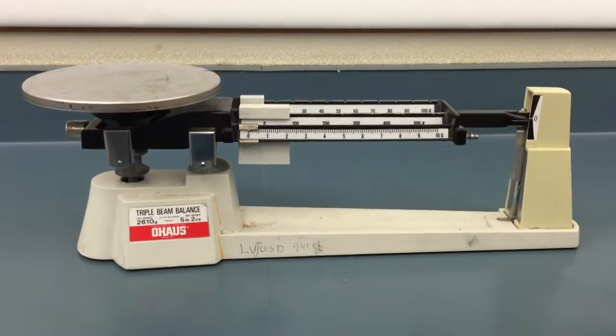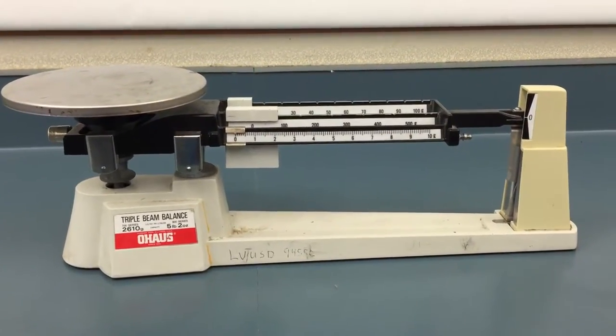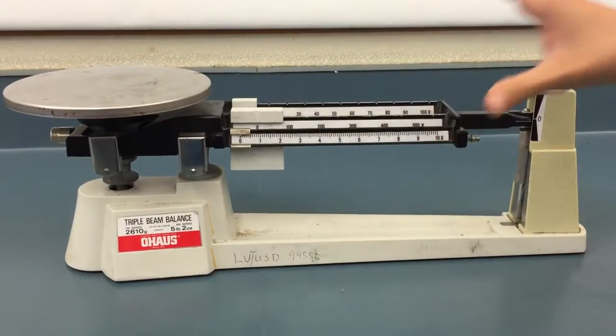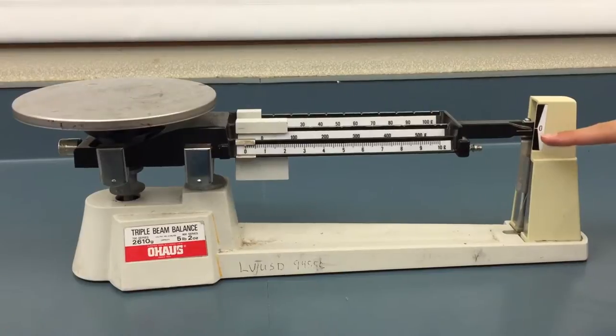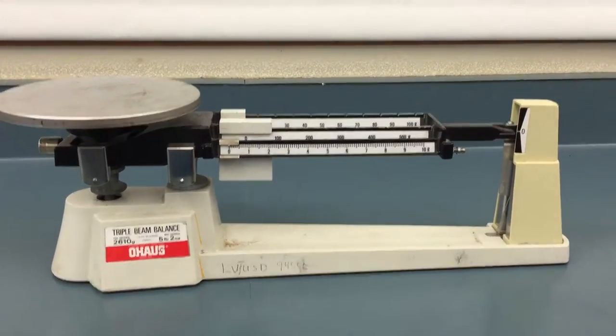So the first thing I'm going to do is make sure that your beam is calibrated. That means the weights are on the bottom, there's nothing on the stage, and the arrow is pointed fully to the zero. And mine's calibrated, as you can see.